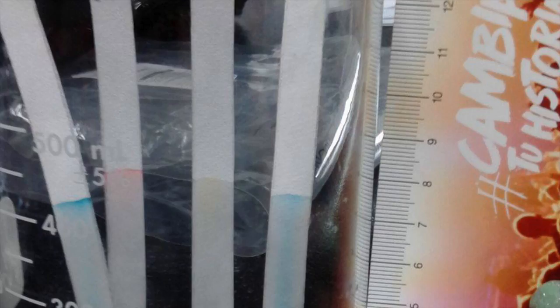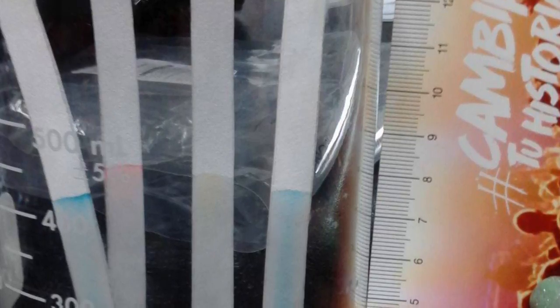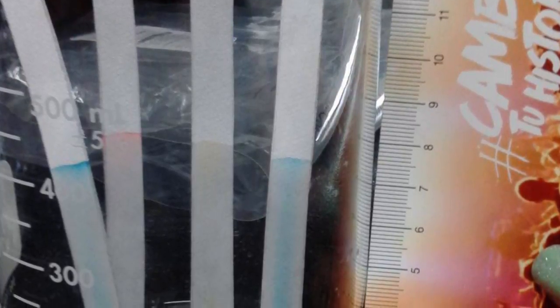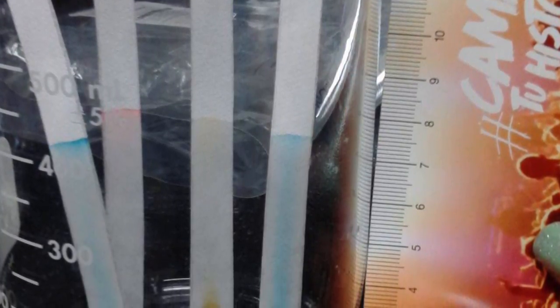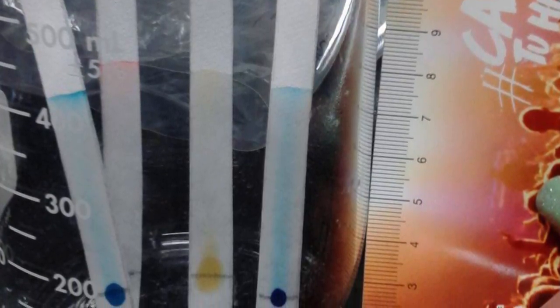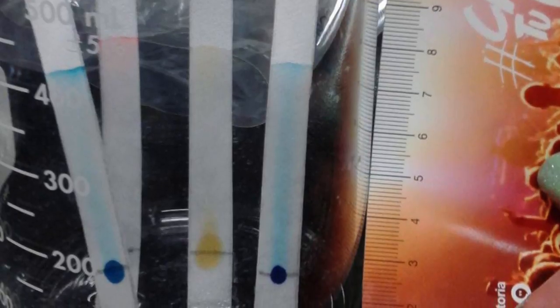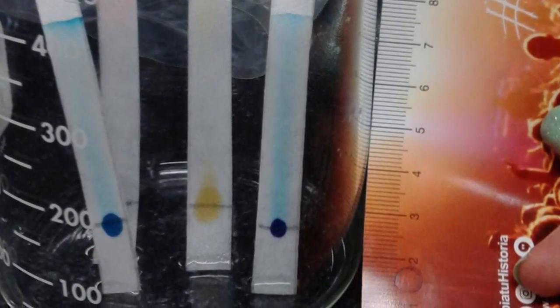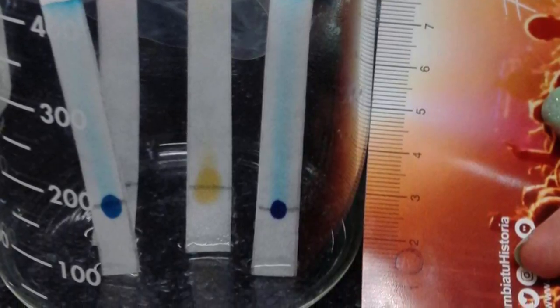In this chromatography practice, what the team did was put a little drop of some liquid compound on a filter paper and then put that paper into water in order to see the highest point that they reach.